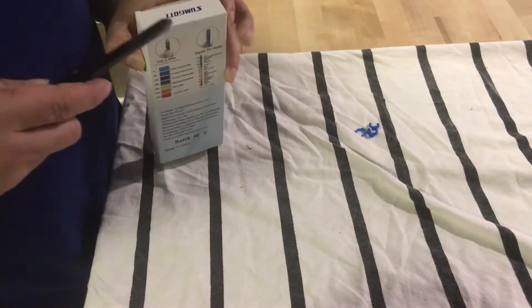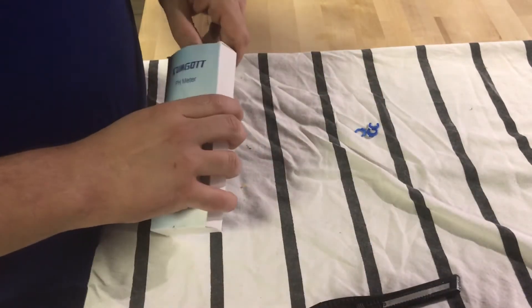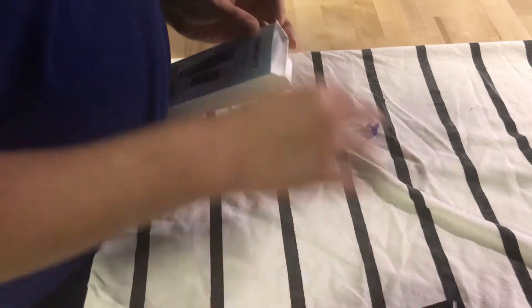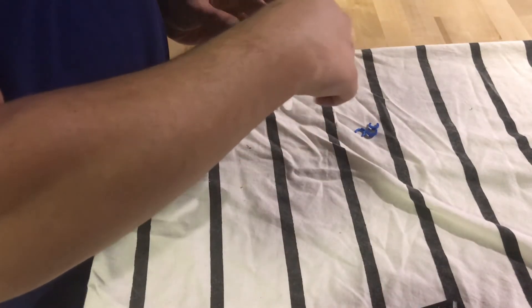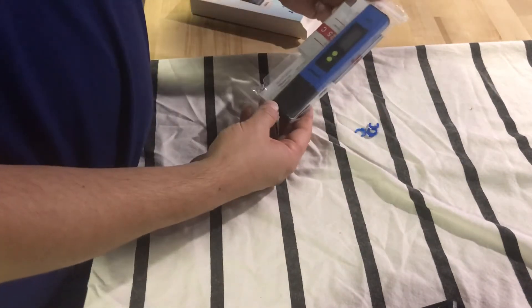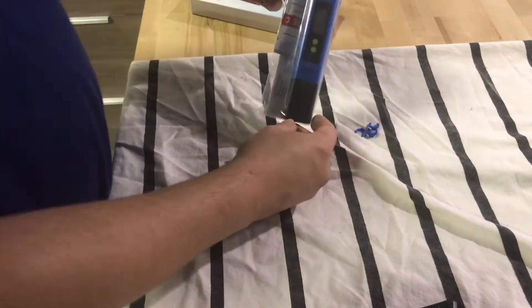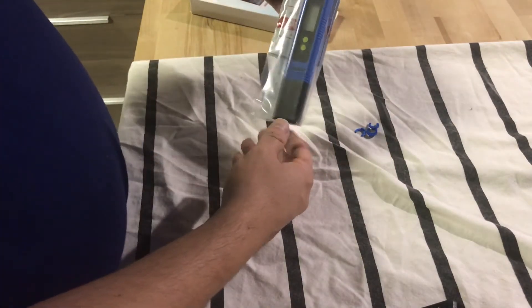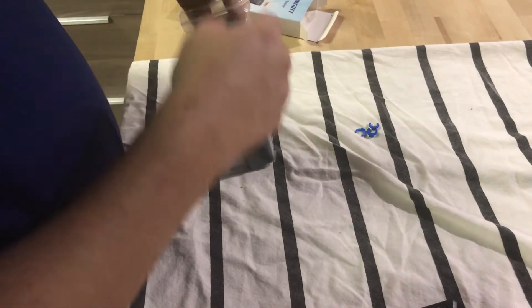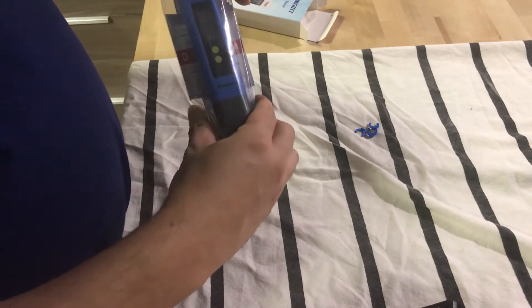See how cool it looks, if it's cool at all. Nothing I gotta cut open, so let's go like this. This is my first time opening it, as always. I don't know if the batteries come with it — that'll be a surprise, let's see.